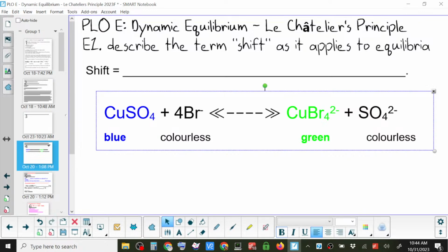So we have our original in the middle. We have our equilibrium shift in which it is shifted to the products over here. We shifted it to the products by essentially just adding more reactant. Increases that rate, goes over there. If we add more product, SO4, it shifts it back to the reactants, which is this one over here. I wouldn't say it's a darker blue, but it's definitely a lighter blue. You can't see it up there, so come on up. Once I just make this a little safer so that you're not knocking this over.